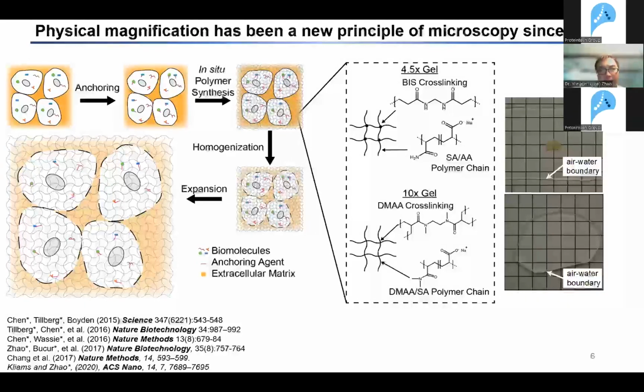But basically, even though there are many different variants, you can always boil them down to several steps. So here I'm just going to summarize this. This is the schematic. So always, first you have to apply a small chemical to modify the target type of biomolecule of interest that you have.